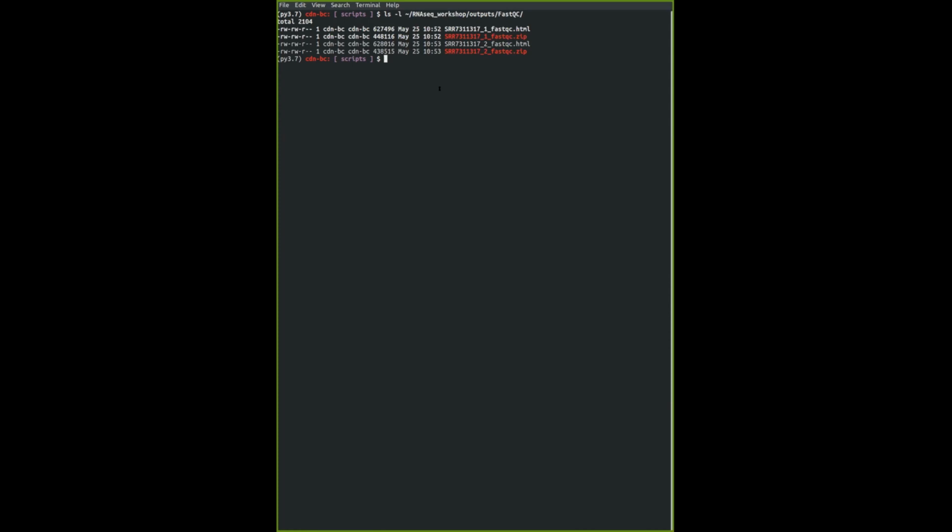If you are on Windows, type in start followed by the name of the file. I'm going to show you the name of the file in a bit. So I'm going to paste this code as well. If you are on Mac, the command is open instead of start. So I'm going to quickly show you. On a Mac, it's open followed by this, the whole entire path to the HTML file.